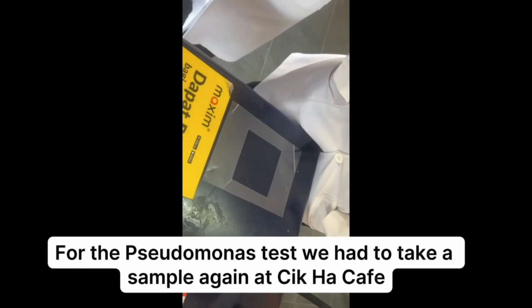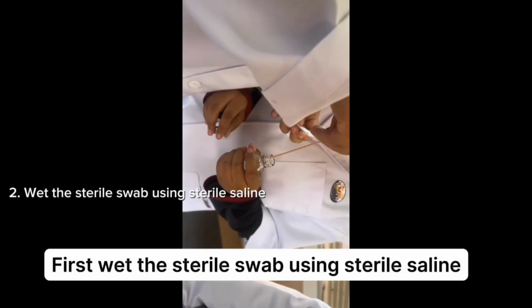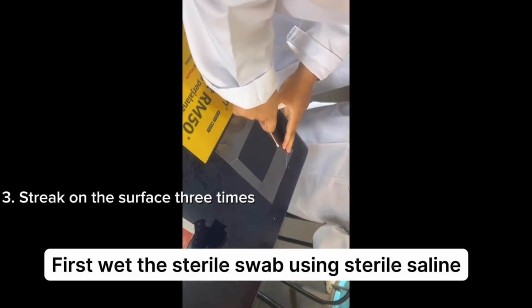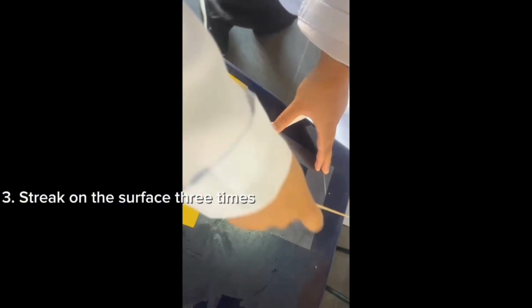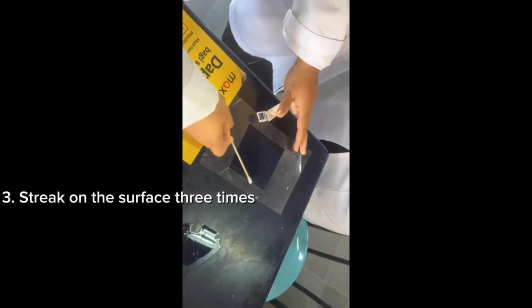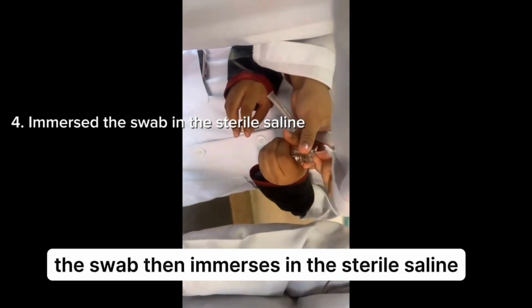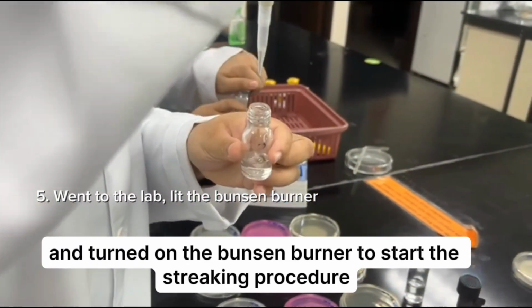For the Pseudomonas test, we had to take a sample again at Cekha Cafe. First, wet the sterile swab using sterile saline. Then, streak 3 times on the table surface using the swab. The swab was then immersed in the sterile saline. Went back to the lab and turned on the Bunsen burner to start the streaking procedure.